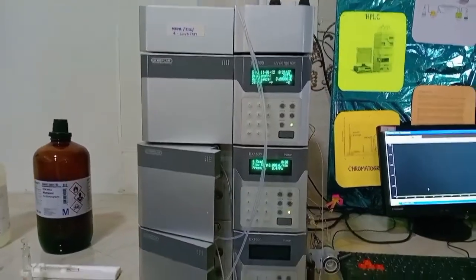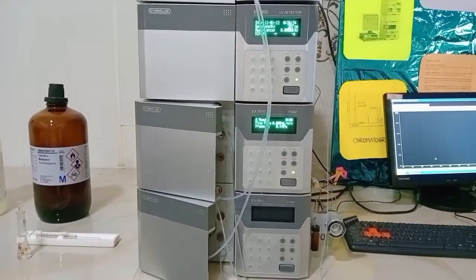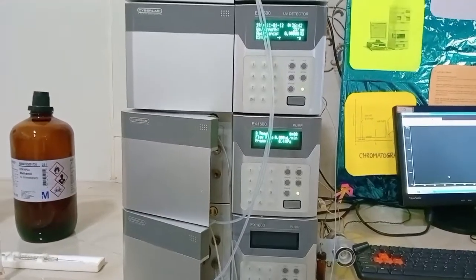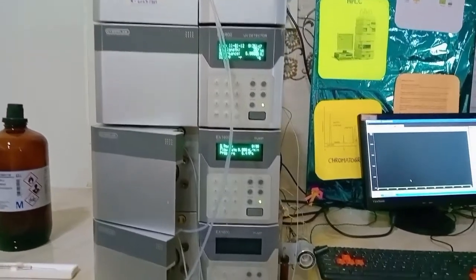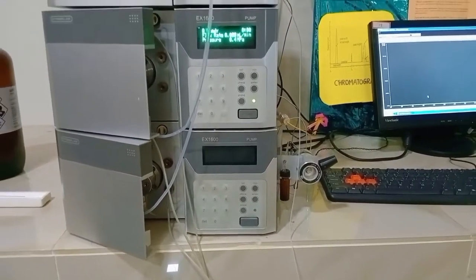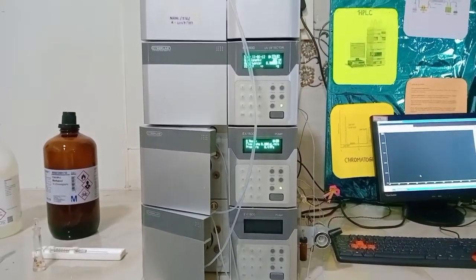It is a non-volatile substance and readily available. It has a strong absorption in the UV region. Various parameters are calibrated in the equipment. Coming to the pumps, the flow rate consistency test and the flow rate accuracy test are done. Coming to the injector, the precision test, the carryover test and the injector volume accuracy test are done. Coming to the detector, we check the linearity of the detector, wavelength accuracy and baseline noise. By checking all these parameters, you can confirm that the equipment is calibrated.